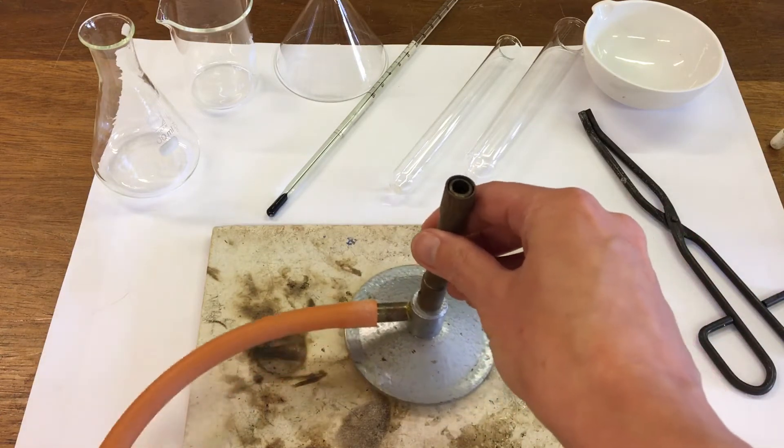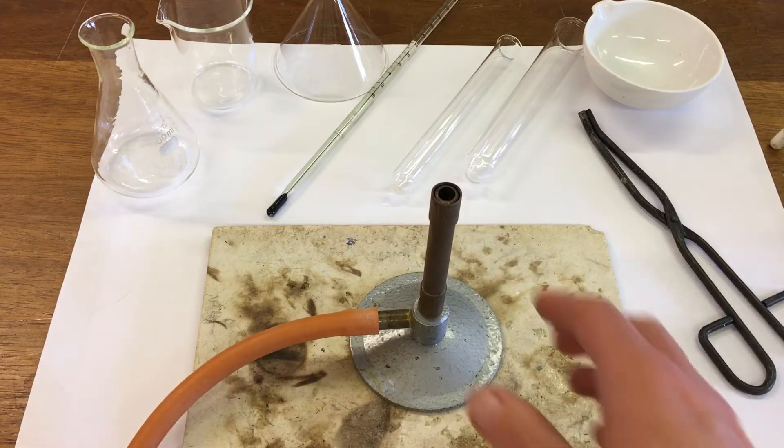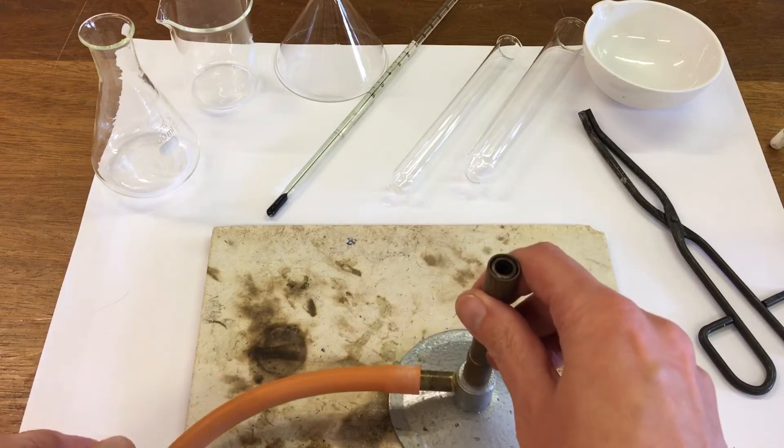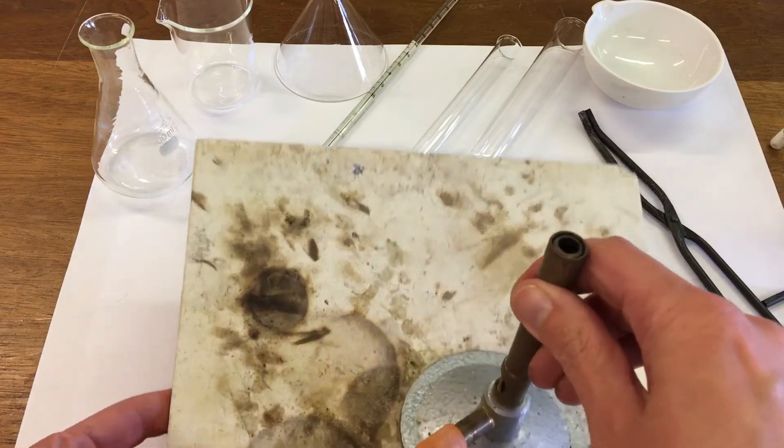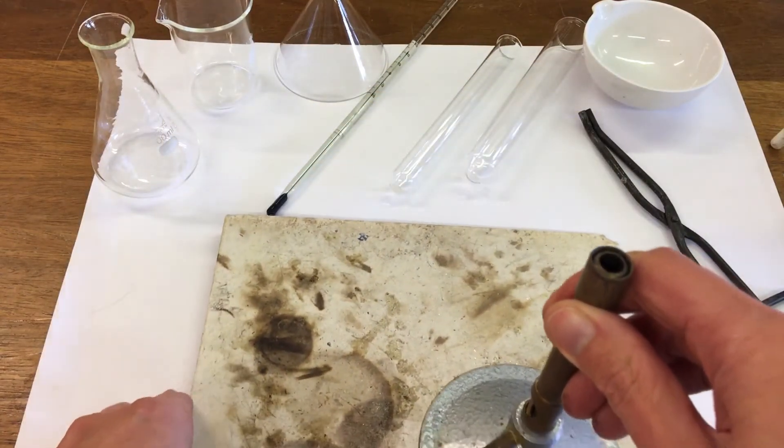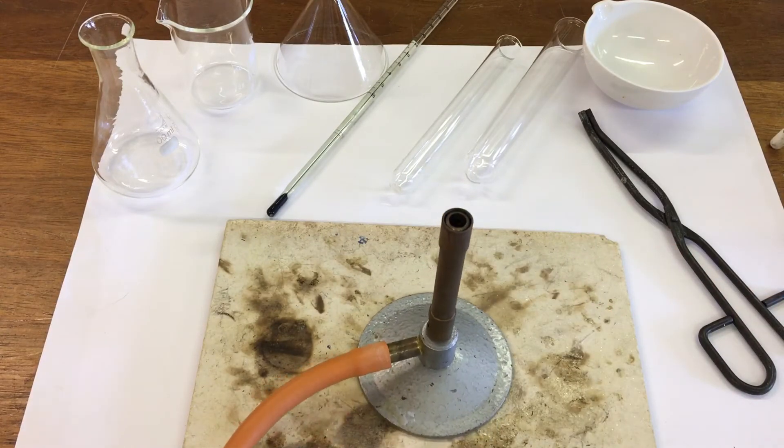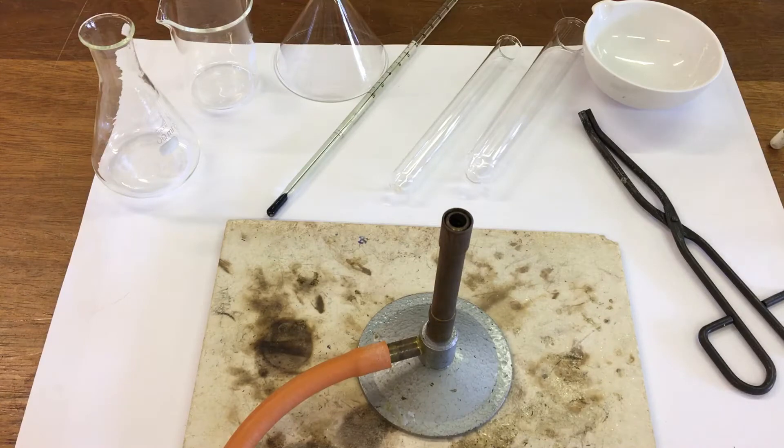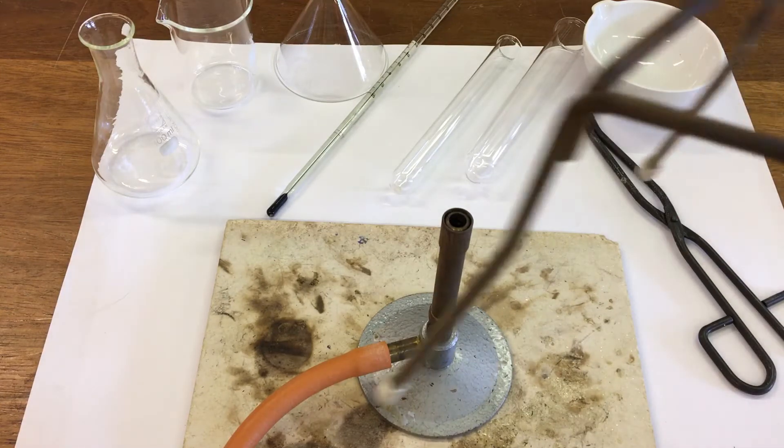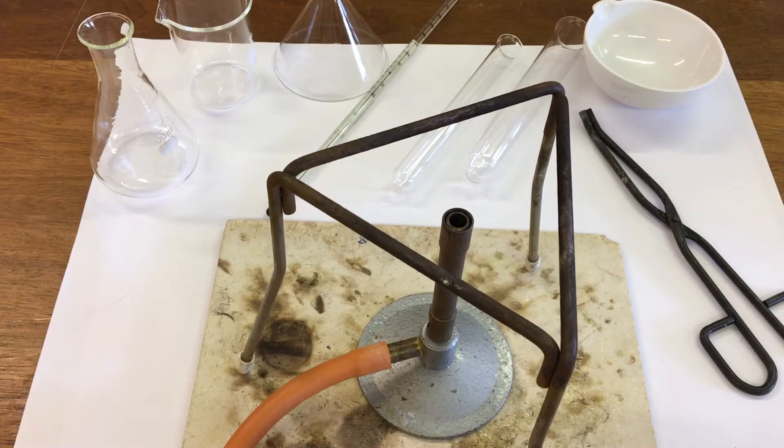That's the Bunsen burner. Our second item is the heatproof mat which the Bunsen burner sits on. That's a heatproof mat here. And next we have a tripod. The tripod sits over the Bunsen burner, so this is the tripod.